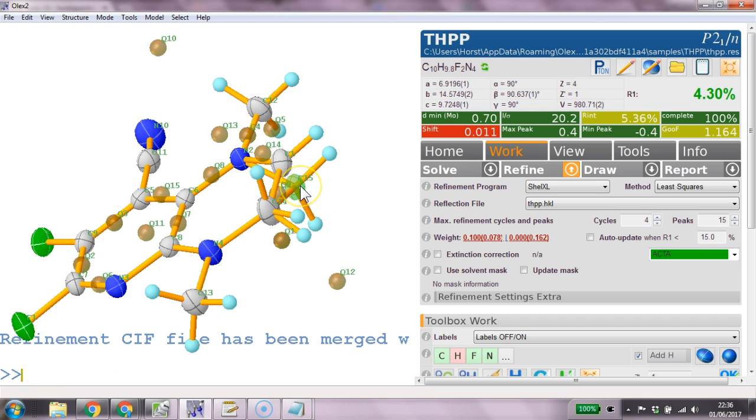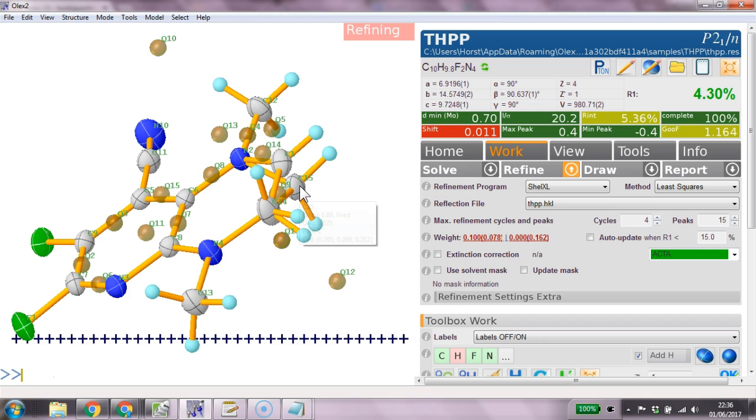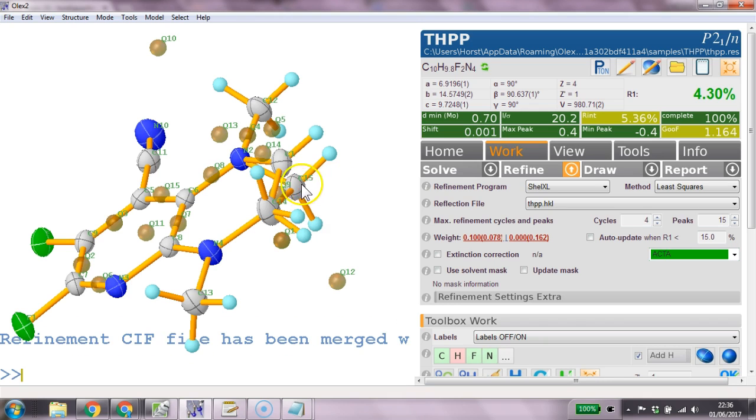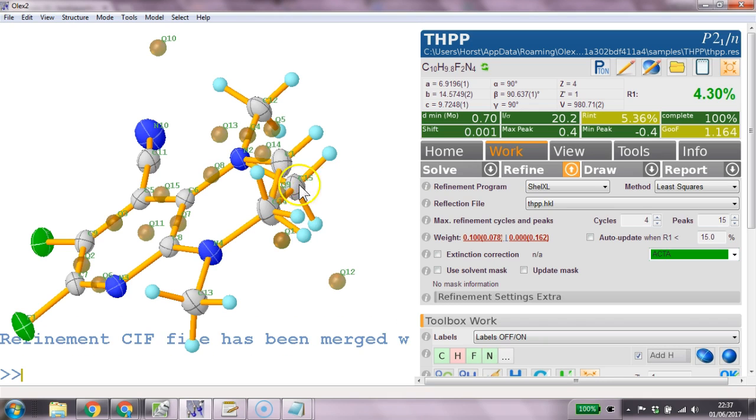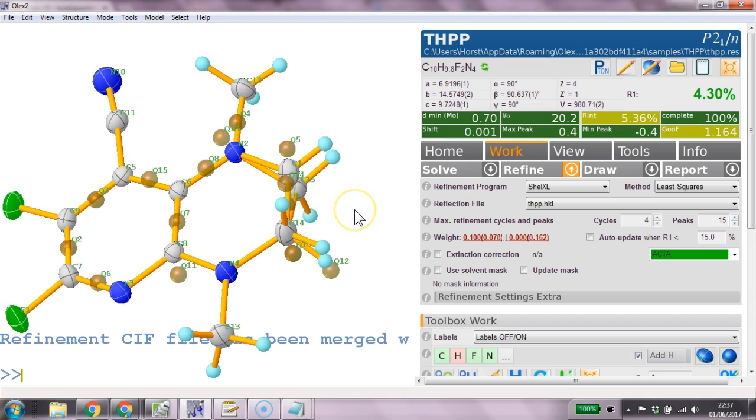And I'm clicking on this because it's just a little bit easier here. Fixed. OQ. 0.88. I wonder why this hasn't actually taken it a minute ago. So these ones are now fixed. There we go. I just showed you how to do this without the mouse.